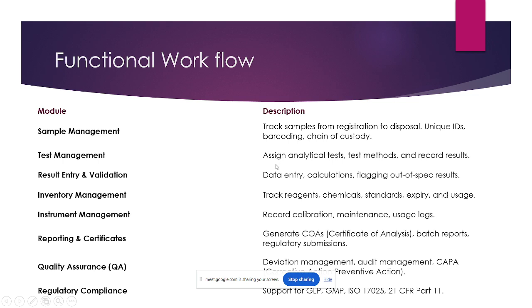And then test management, where we need to assign the tests. Whatever tests are required, either pH, description, or HPLC, we need to assign them, and we need to perform the test in the test management module. The sample management module is only for sample generation. Some industries will configure both as a single lot. In this, the sample will be generated automatically, and the tests will automatically be assigned to the specific sample. That is also a simple configuration.